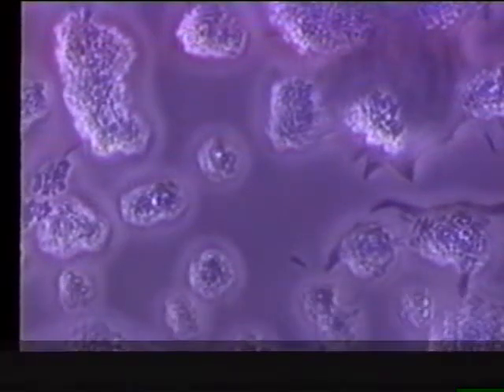Notice that the rate of movement is variable. Some cells move fairly rapidly and other cells move hardly at all. Single cells tend not to move. Groups of cells move better.